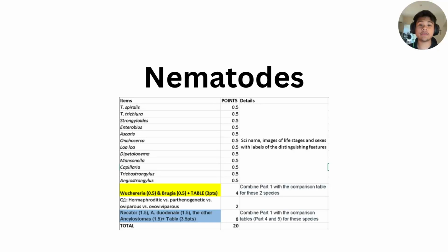So good day everyone, we are the Itchyworms and we are going to have a quick review session for the lab exam focusing on nematodes. The goal of this review is to help you refresh your memory on the major characteristics used to identify nematodes, especially the ones commonly found, or the specimens we have in the laboratory.